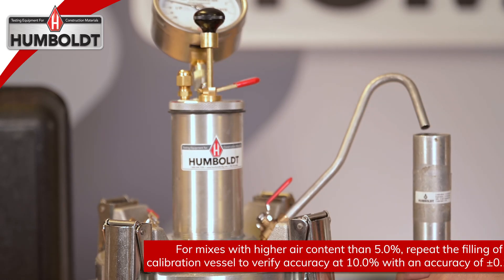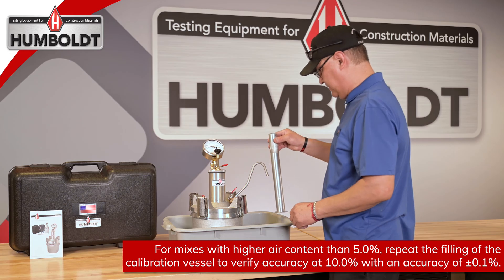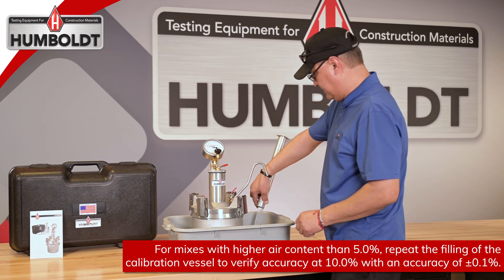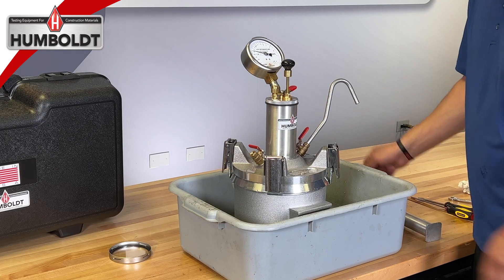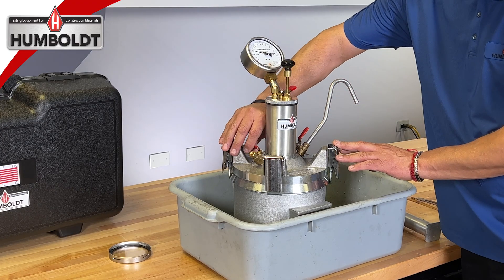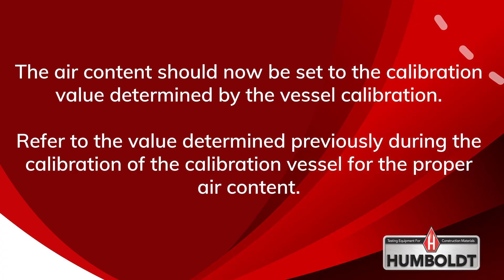This action removes exactly a volume of water equivalent to 5% air content, which is within the normal range of use in most concrete mixes. Once completed, open the opposing pet cock, which will allow residual water to flow back into the base. The air content should now be set to the calibration value determined by the vessel calibration. Refer to the value determined previously during the calibration of the calibration vessel for the proper air content.